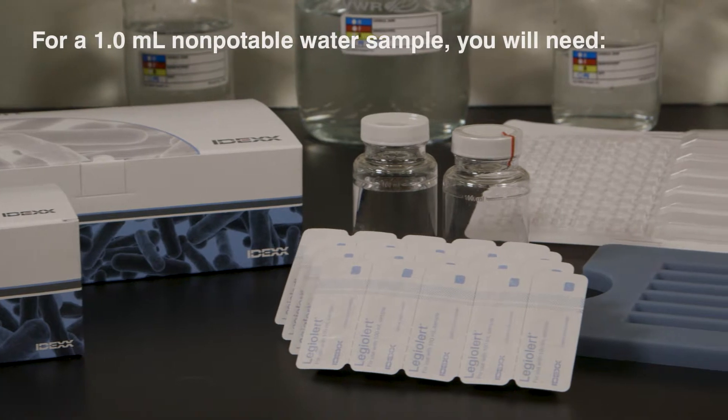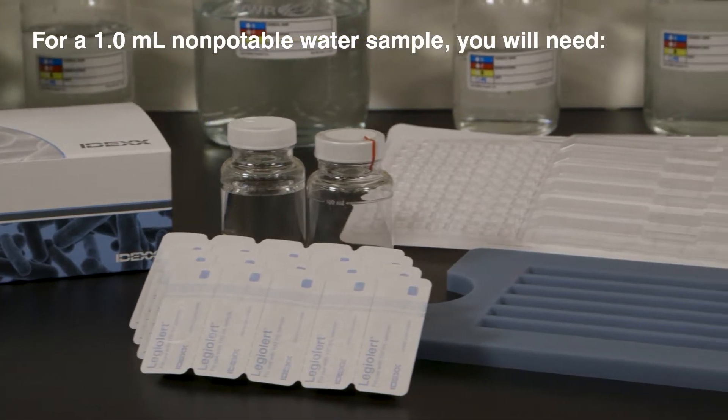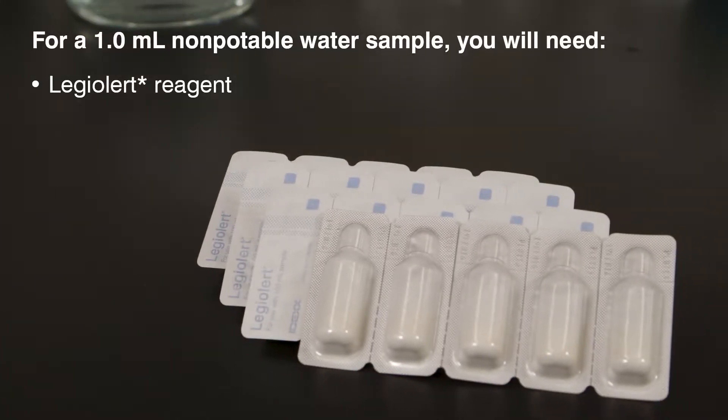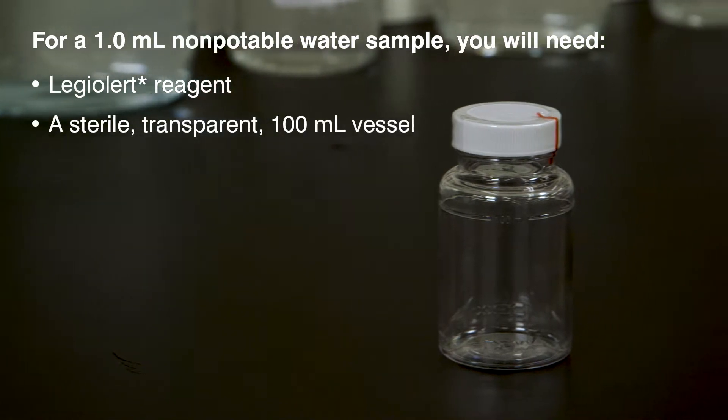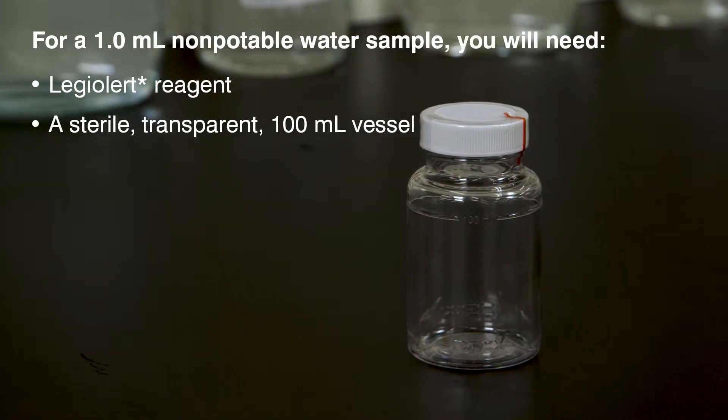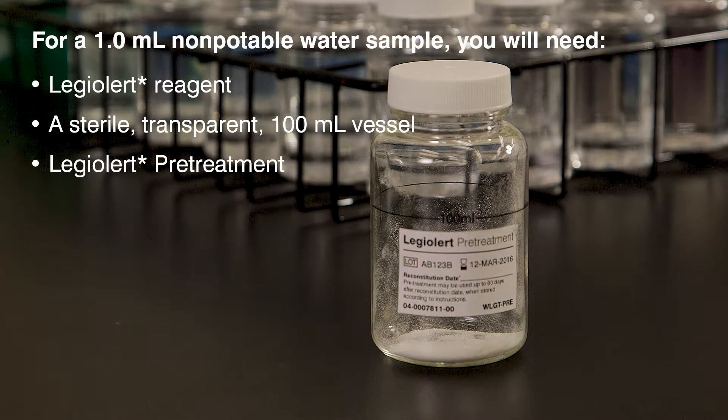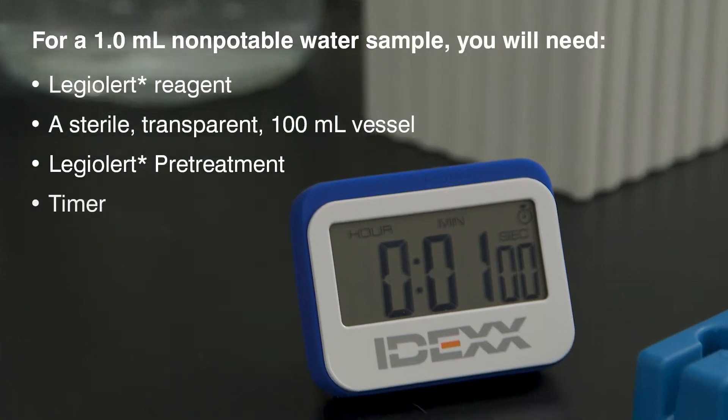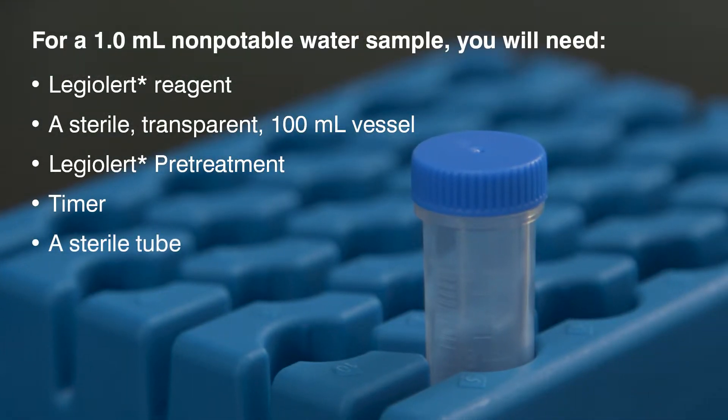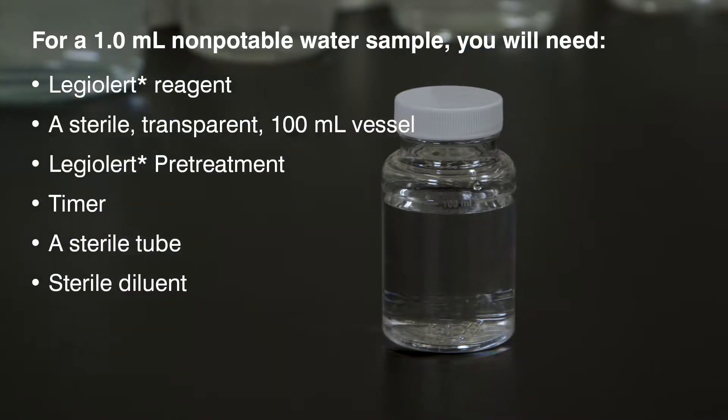To prepare a 1 mL non-potable water sample, you will need the LEGALERT reagent, a sterile transparent 100 mL vessel, the LEGALERT pretreatment kit, a 1-minute timer, a sterile tube, and sterile diluent.